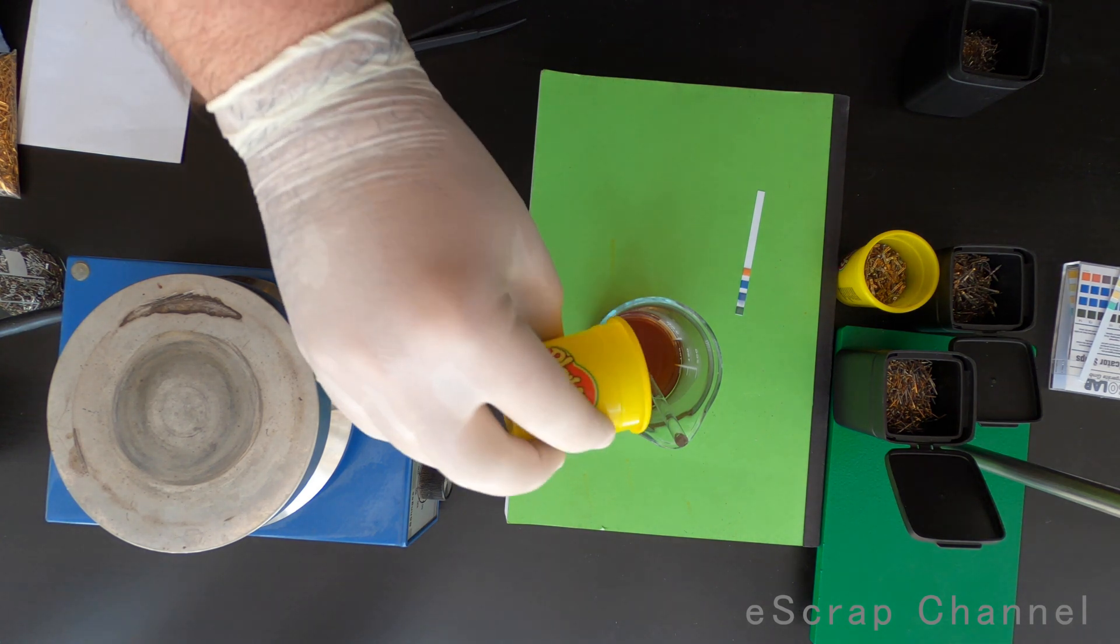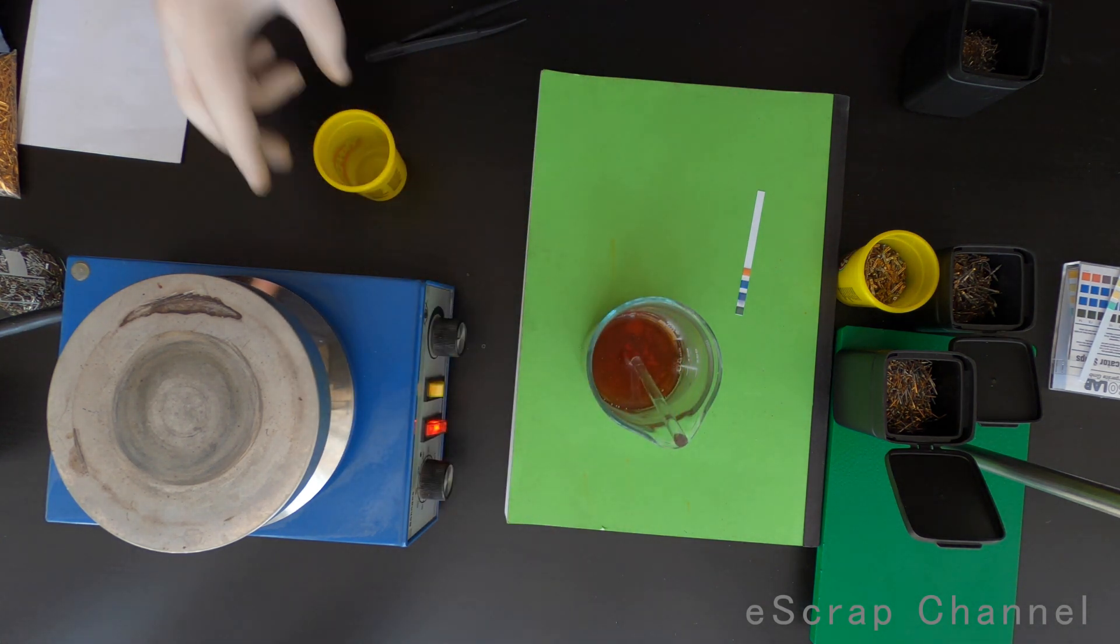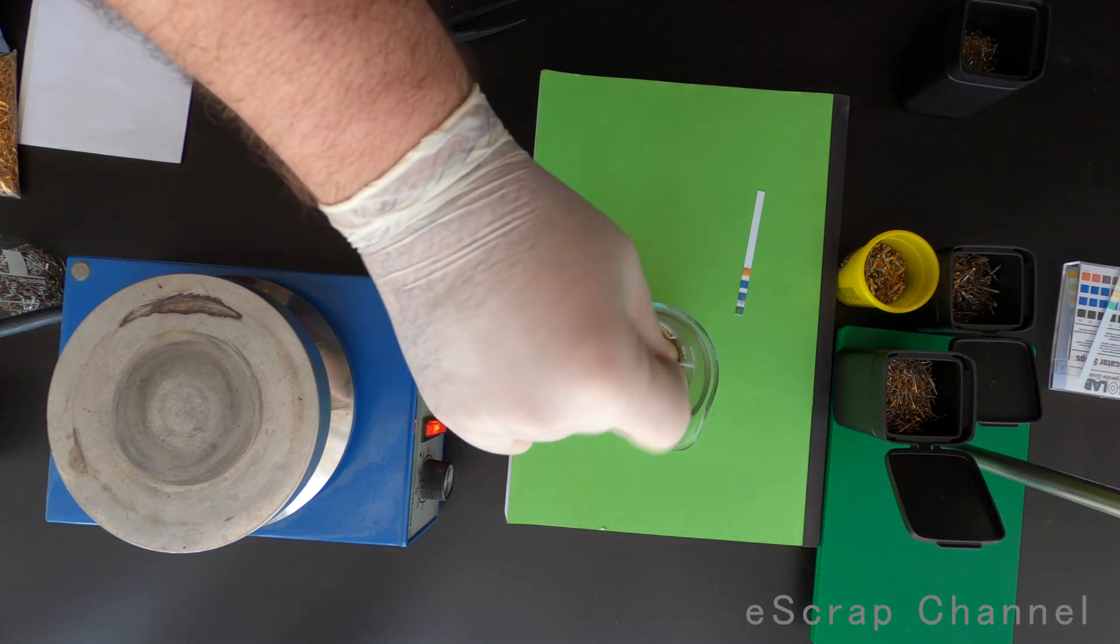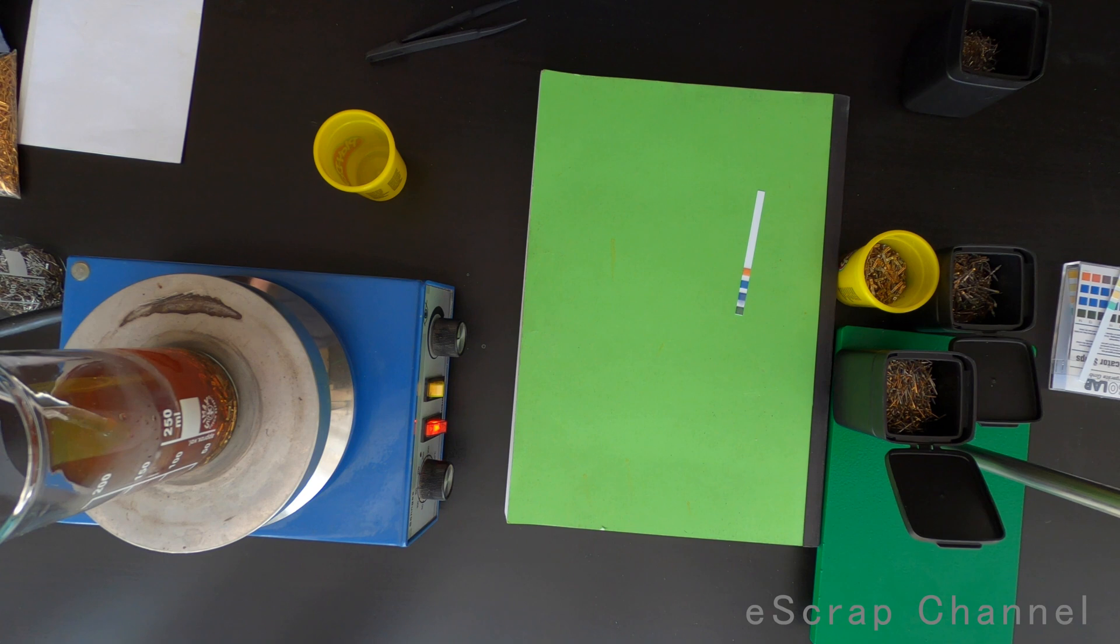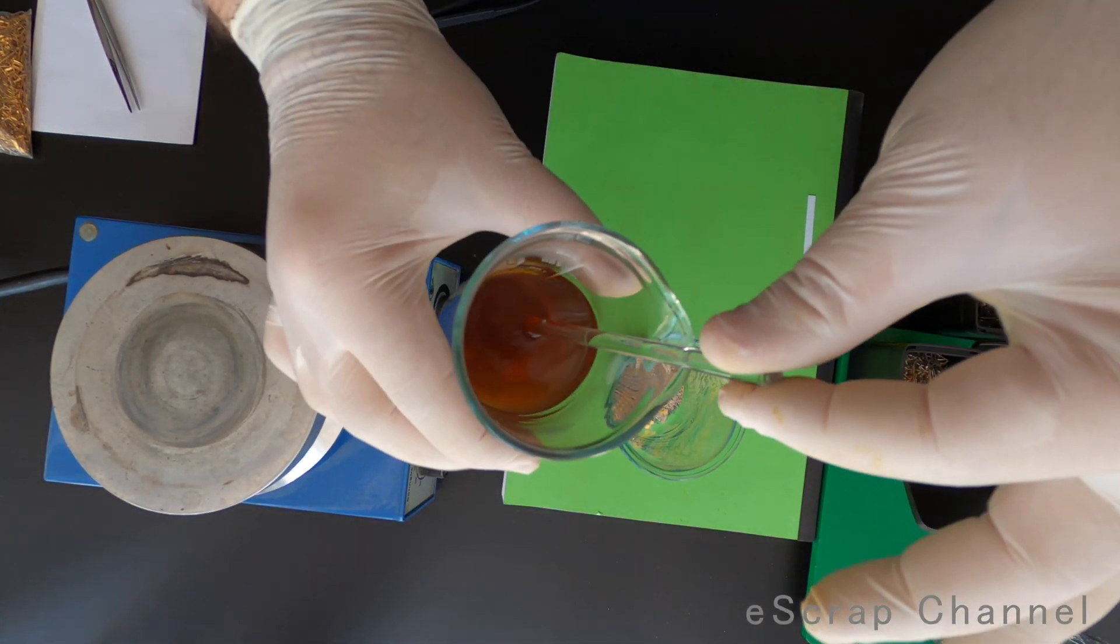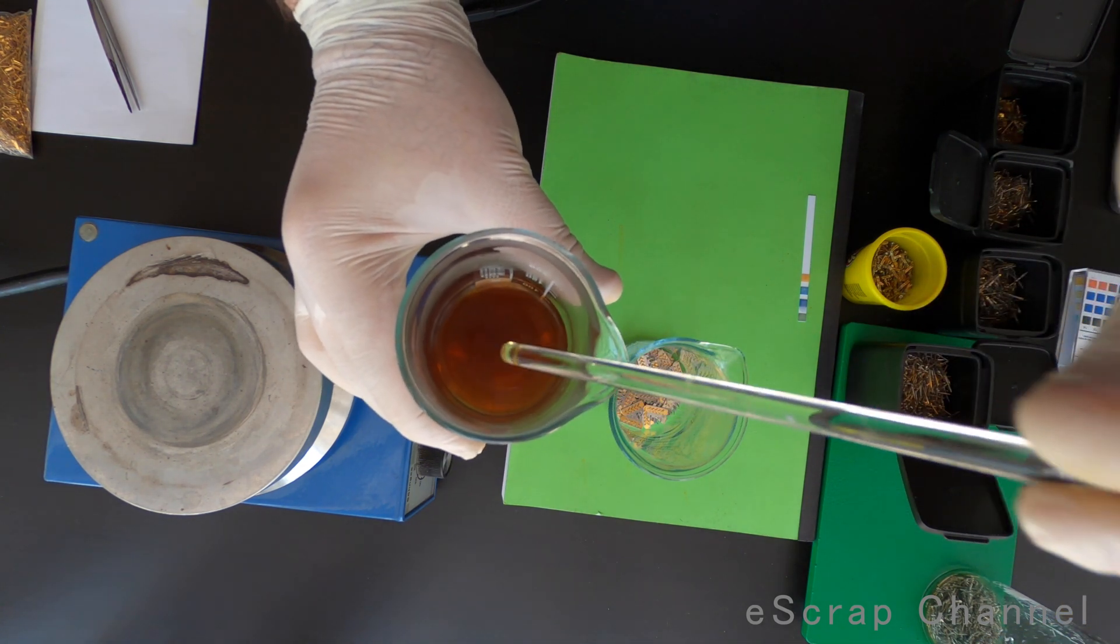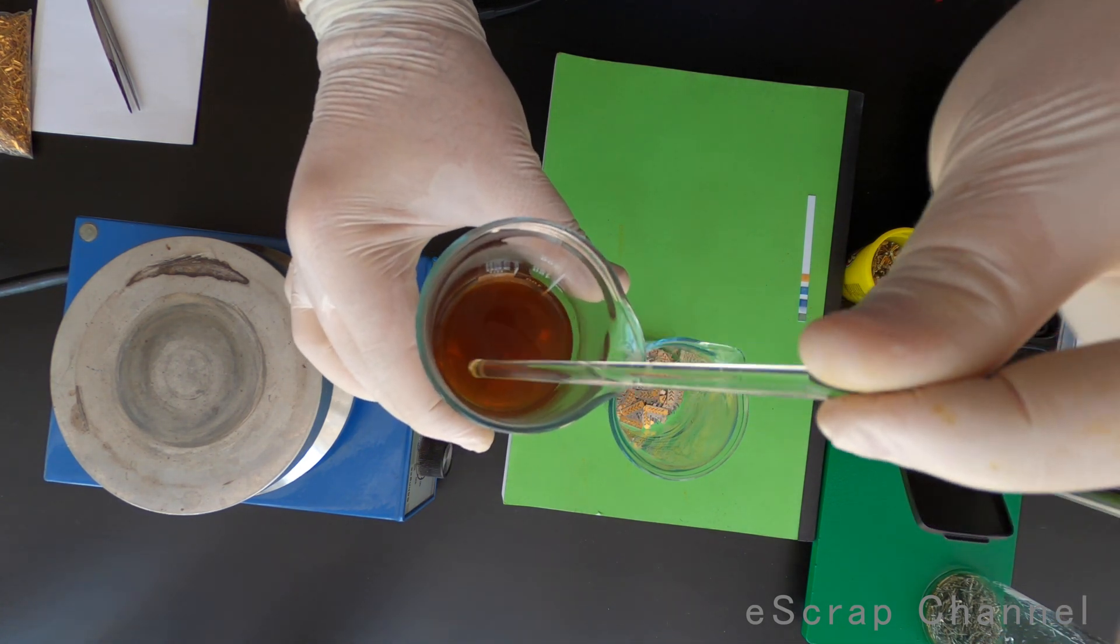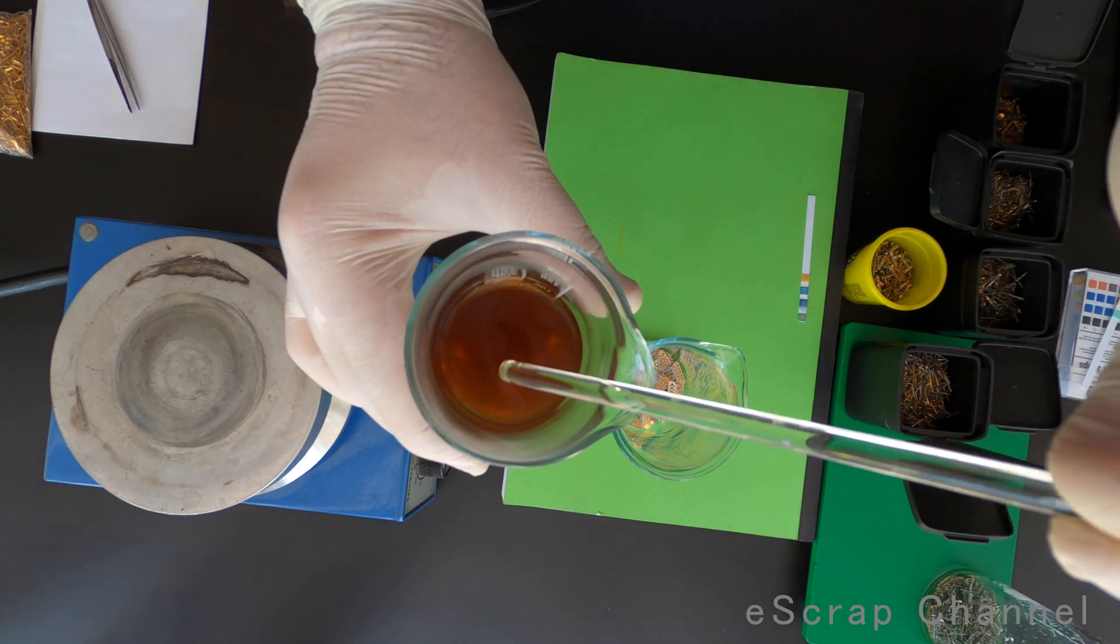Next batch. I will turn it to the hot plate and let's see. Ten minutes later, we have this solution. It's getting more and more dark brown color.